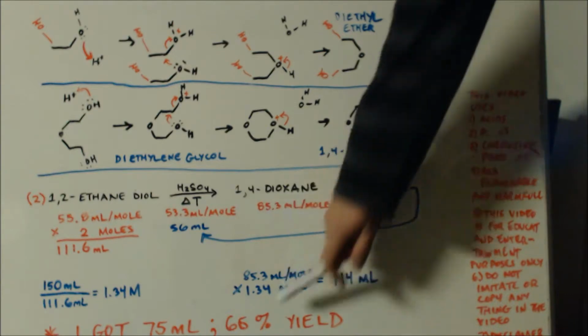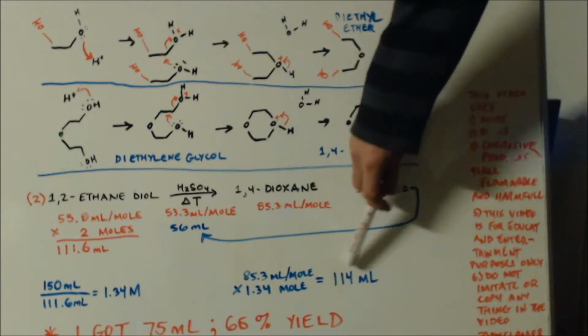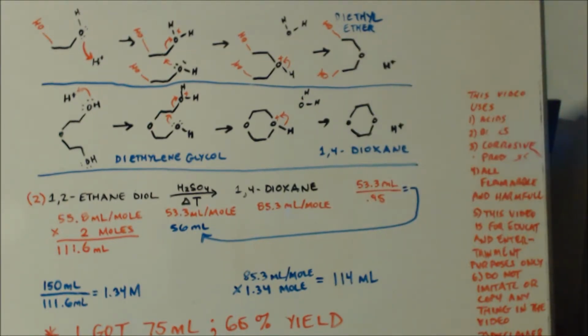So I took the dioxane and I times it by 1.34, right? And that tells me my theoretical yield should be 114 milliliters. I got a crappy 75. But for the first time I did it, 66% yield wasn't bad, I guess. Plus, when it was real tarry, most people go through that tar until they're really scared that the tar is gonna foam up and go into the cold condenser and break it. You know what I mean? As soon as it even thought about moving up, I stopped. You know what I mean? So I'm sure that hurt my yield.